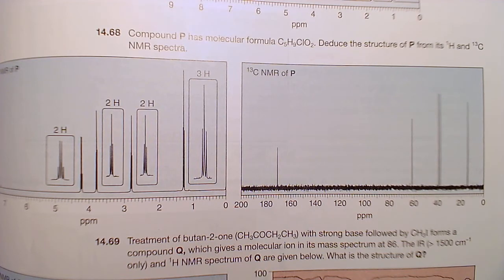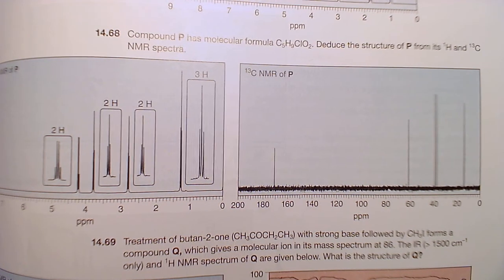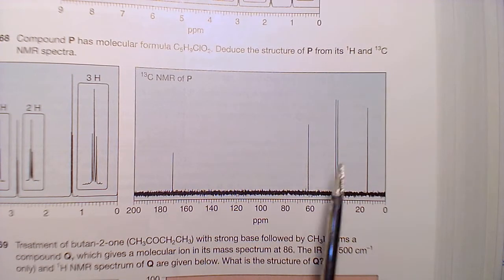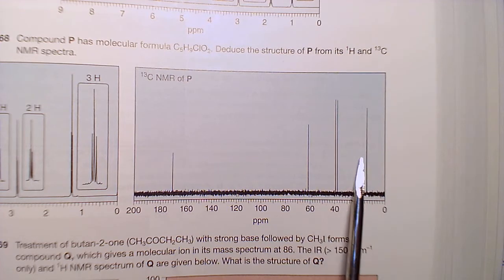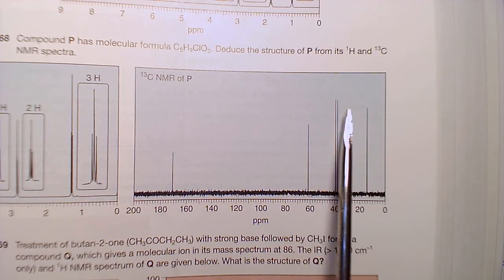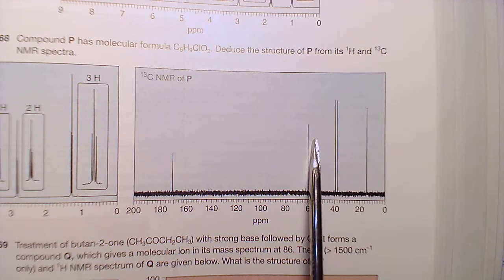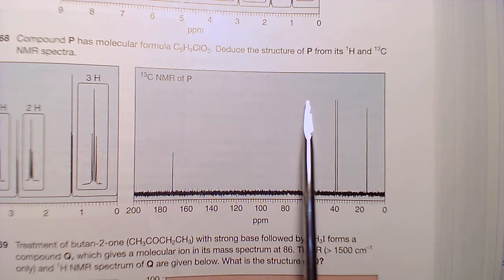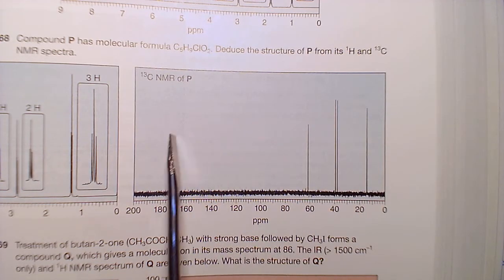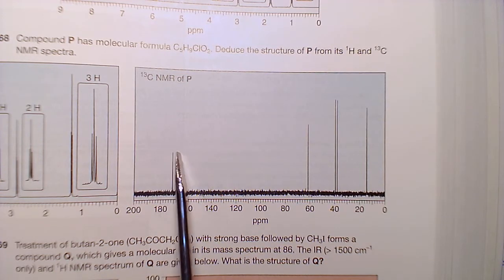And when you go through this problem, what we see when we're looking at the carbon-13 spectrum here, what do we notice? Okay, here's our saturated alkane range right here, 40 to 0. And so we say these are probably setting our peak height. And these two peaks, this peak, are all roughly the same height here. And as we go this way, notice this peak is smaller. It's definitely smaller than the other peaks here.